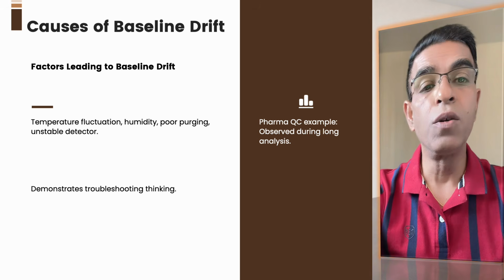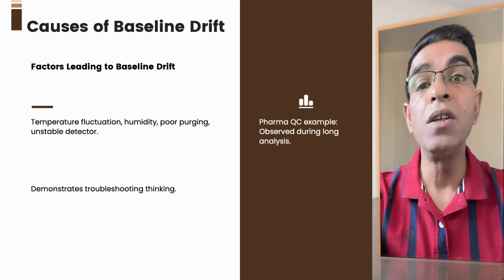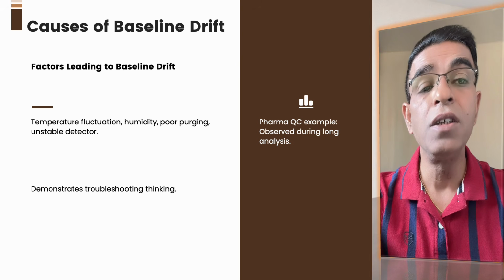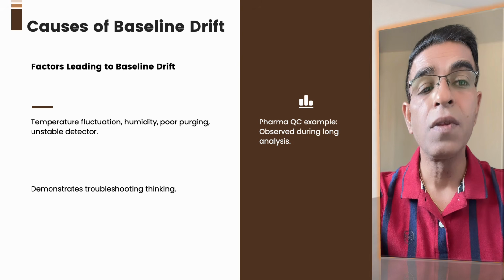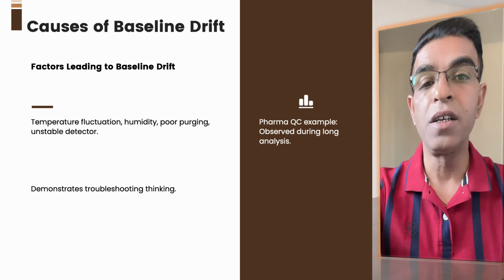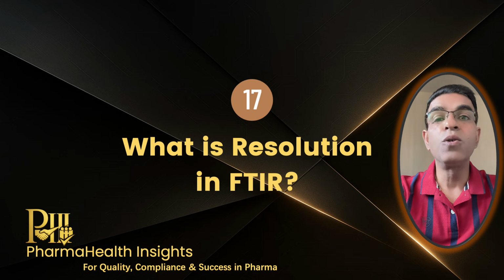Then add the practical conclusion. That's exactly why FTIR instruments are always kept in a controlled environment with proper purging and sufficient warm-up so that we get stable and reliable spectra. This answer shows practical understanding. So my dear friend, you are doing a good job and answering the questions very well.